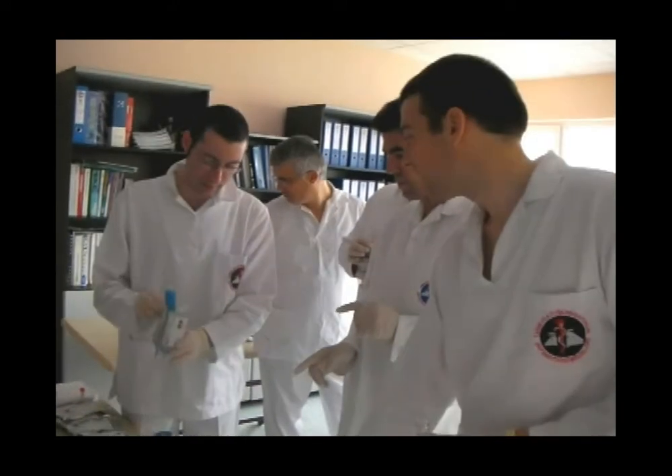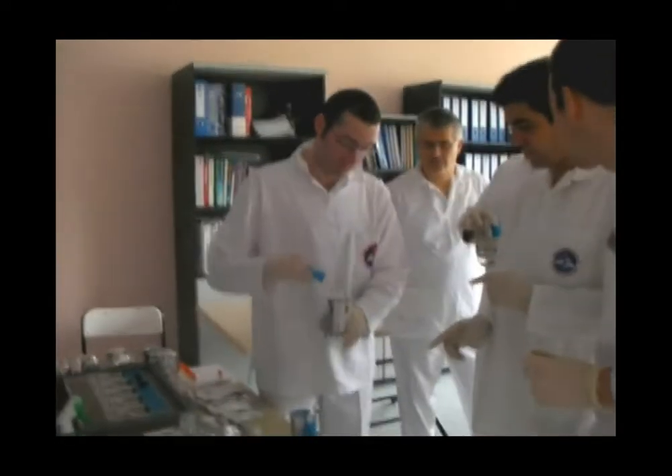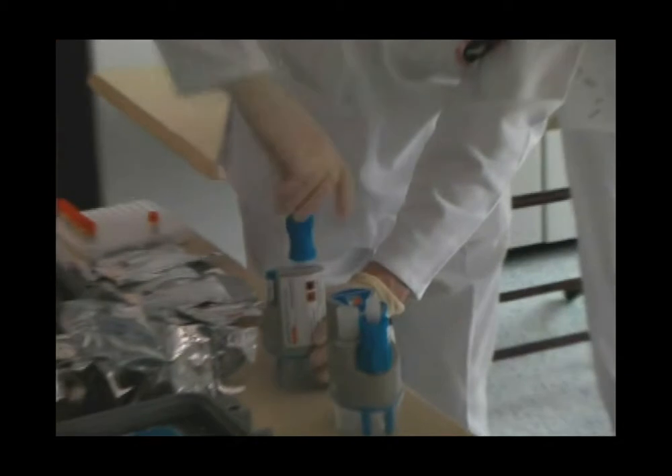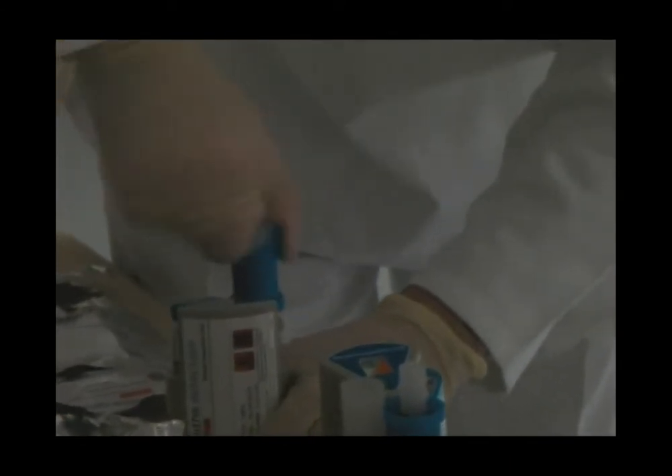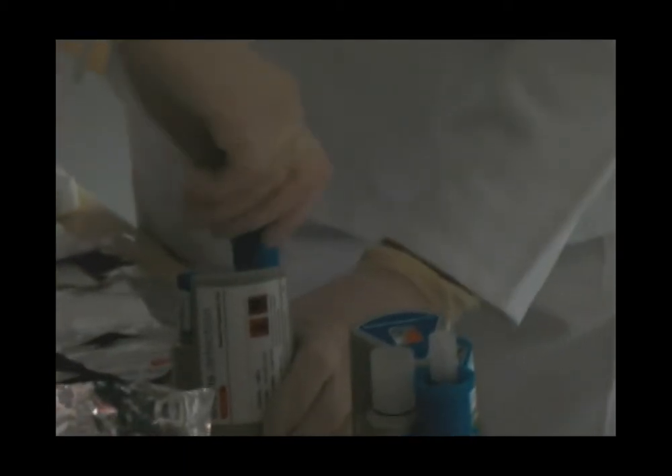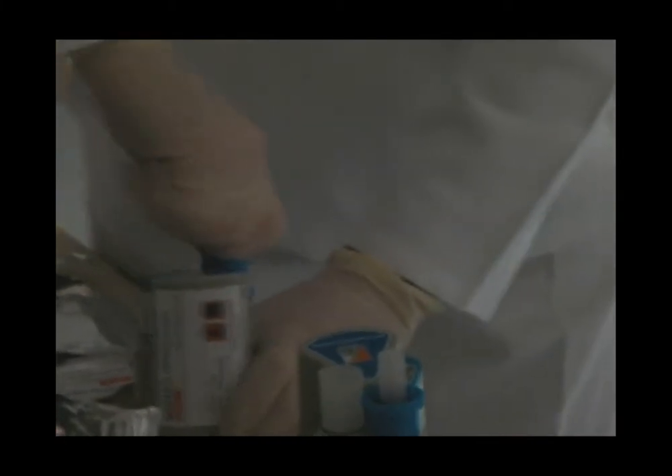We've put this sample in there. Take this bit off and then screw down. Just keep going — you'll feel it get harder, then it'll sort of pop. Keep going until you physically can't turn it anymore.